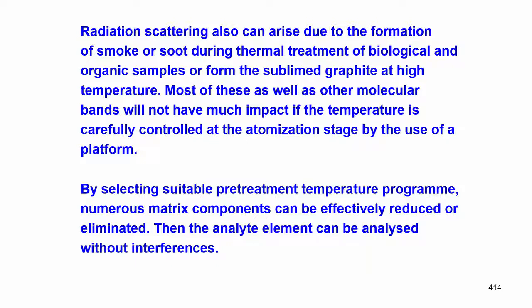Most of these, as well as other molecular bands, will not have much impact if the temperature is carefully controlled by the STPF, the stabilized temperature platform furnace concept, and carefully controlled at the atomization stage itself. Then there should not be any problem. But we should be aware of interferences of this kind.